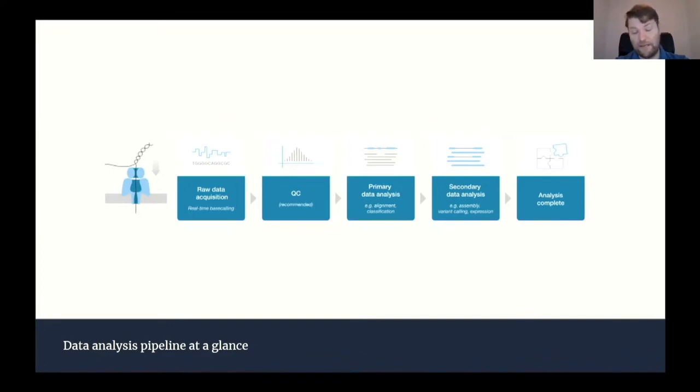That's sort of a classification application, for example. Or it might be that we try to start assembling these things, or at this point I think we usually start aligning these things to see if we can find overlapping pieces and puzzle them together a little bit. And if we actually want to have the whole genome, which you don't often need, but in many cases you do, then you move on to assembly. The point is to take all these fragments and put them together in a long list and try to recreate the genome from end to end itself.